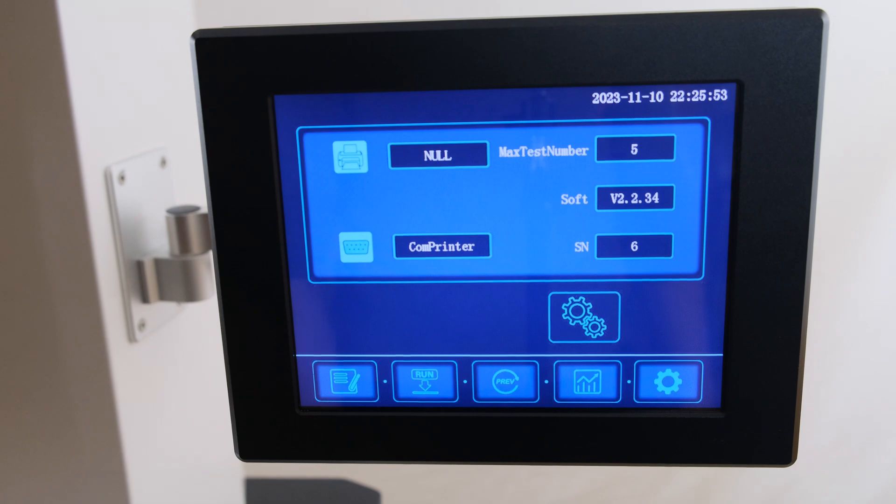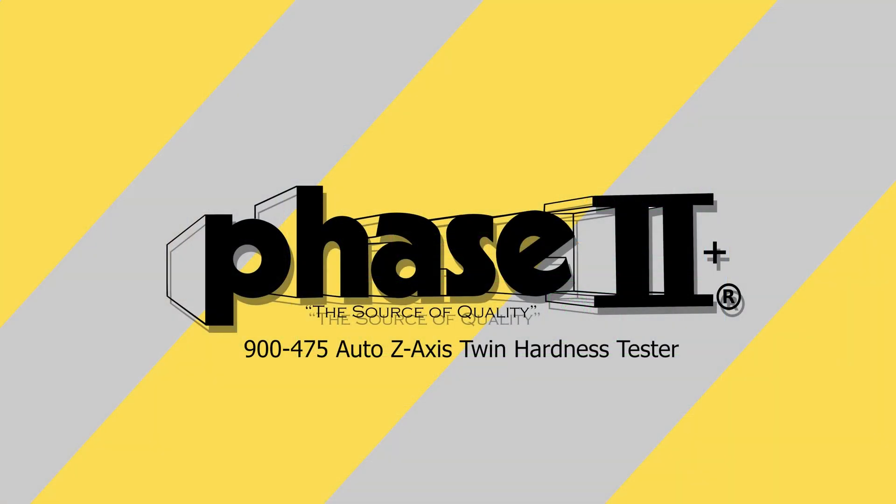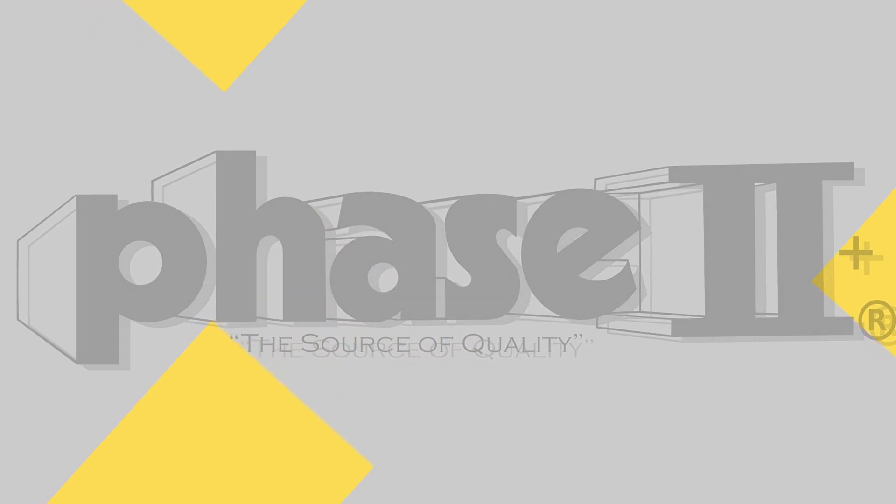The fifth icon will open the machine's settings menu. This menu allows for control of the maximum test number size for batch control, as well as both serial port and Bluetooth configuration. Please refer to the owner's manual for further instructions on the appropriate settings for each use case. This concludes our application and function guide for the Phase II 900-475 Auto Z-Axis Twin Hardness Tester.